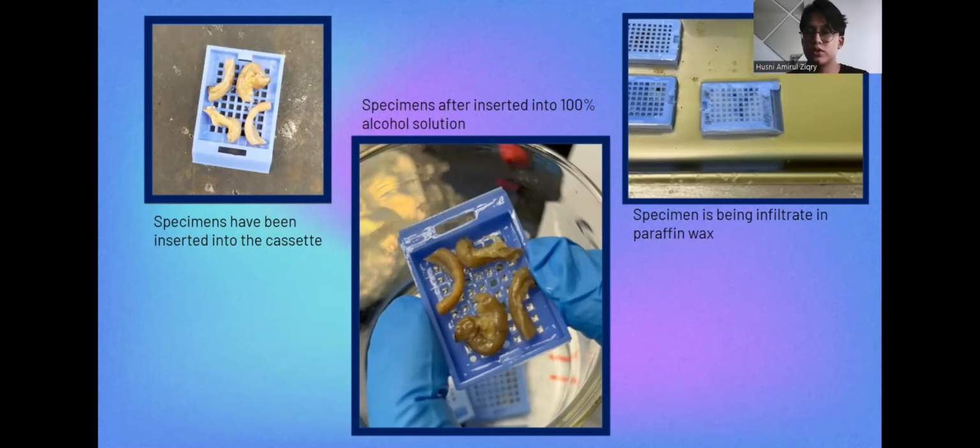In the last picture, as you can see, the specimen is being infiltrated in paraffin wax. This is the infiltration process, where the specimen is inserted into the paraffin wax for 1 hour, 1 hour, and overnight.